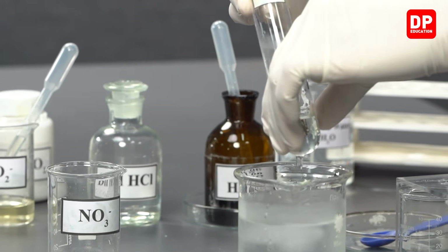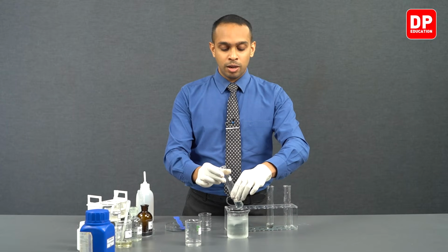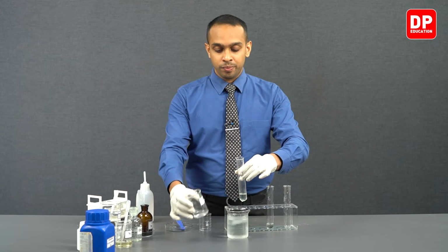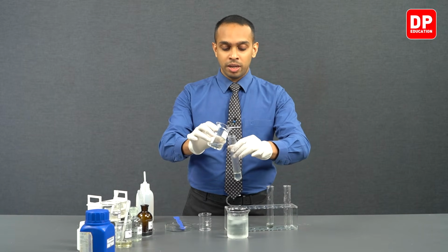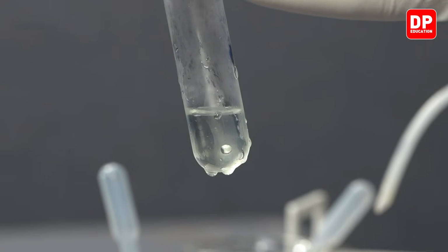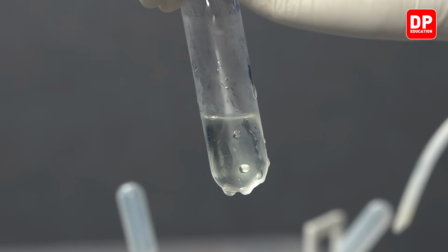And the solution is now somewhat cold, so we can add our nitrate ion solution to this boiling tube as well.